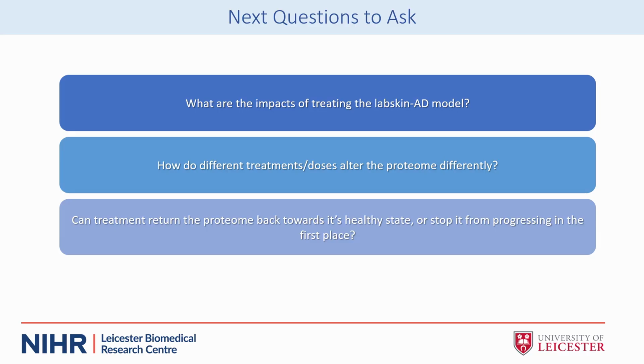We're currently doing ongoing work looking at the impact of treatments on the model and whether certain treatments can soothe that dysregulated proteome that we see in the AD model and move it back towards that healthy state or stop it from progressing in the first place.